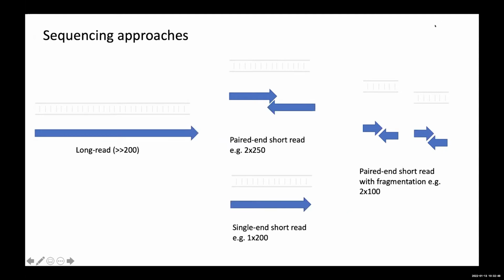The read length varies by platform and kit, but typically the longest paired end run mode for Illumina is 2 by 250, 2 by 300, something around there. It doesn't scale up very much more than that. And for Proton, somewhere around 200.